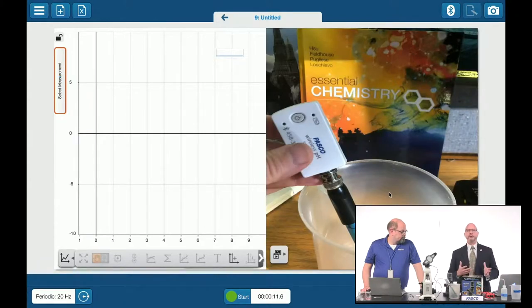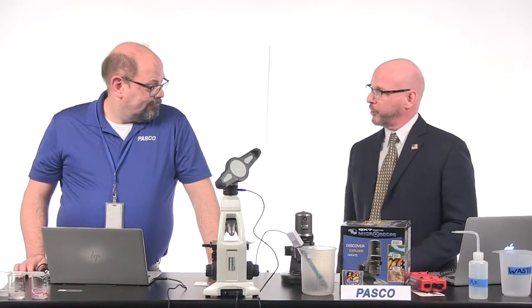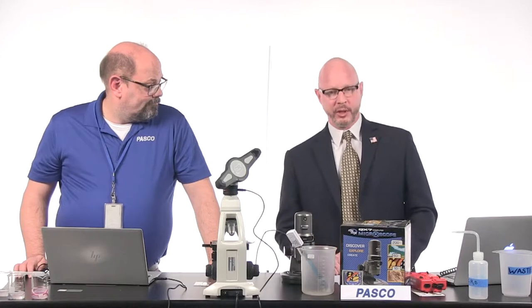So now I'm actually pulling in either pictures that I took and put on my desktop, or you can put together an entire PowerPoint presentation and drop those slides in so that your students can go through the slides of a presentation and collect the data. And in any case, whether it be with the slides that you prepared as images or slides that you're pulling off of the microscope, you're able to see some really great stuff.